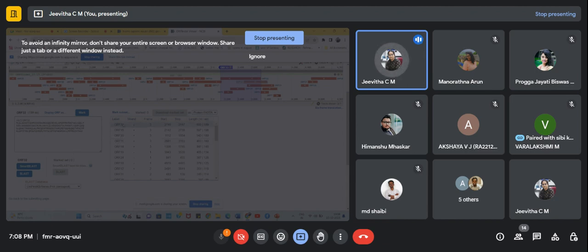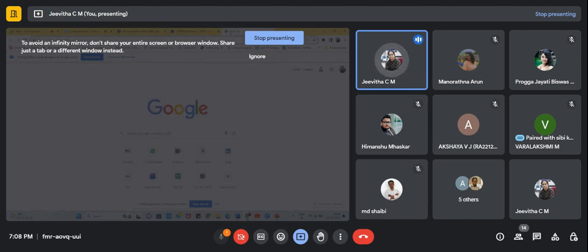According to the primer designing I have done, I felt that taking the positive strand is very easy, and it gives us less confusion and makes handling the data easier. So you now have to reverse complement this strand. For that I'll be using another bioinformatics software called reverse complement.